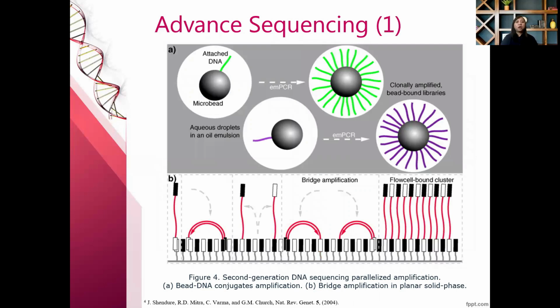Advanced methods of sequencing involve shotgun sequencing and de novo sequencing. De novo sequencing is used to determine the sequence of desired DNA with no known sequence. The shotgun method is designed to analyze sequences longer than 1000 base pairs, where the large genome is broken down into random fragments.